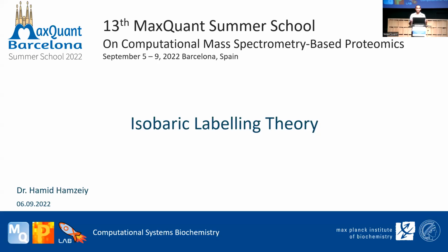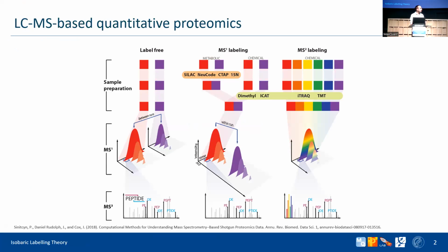So this is very different from the things that we have been doing so far. We've had several talks during the summer school about label-free quantification and how that works. You have several different runs for each of your conditions. You have a run, and using MaxQuant, you are able to get very good identification and quantification rates for the proteins across samples.